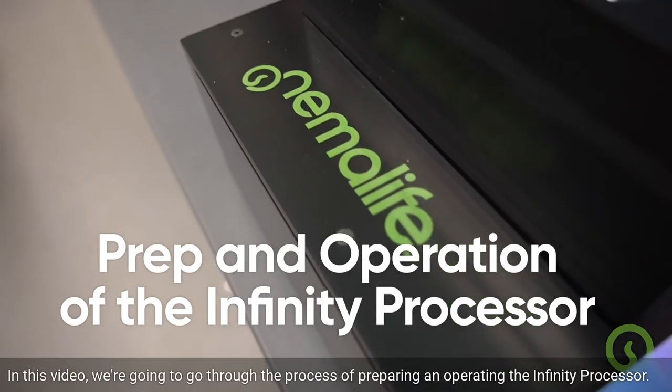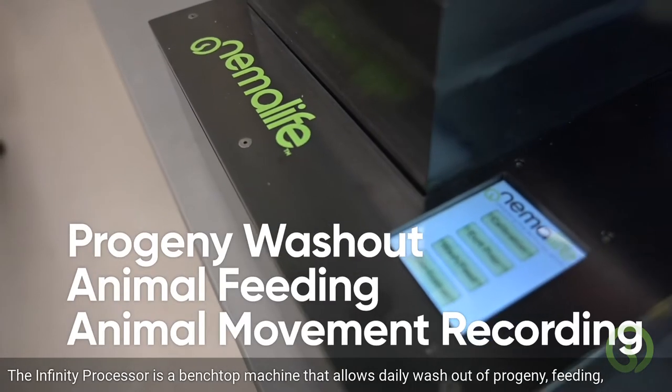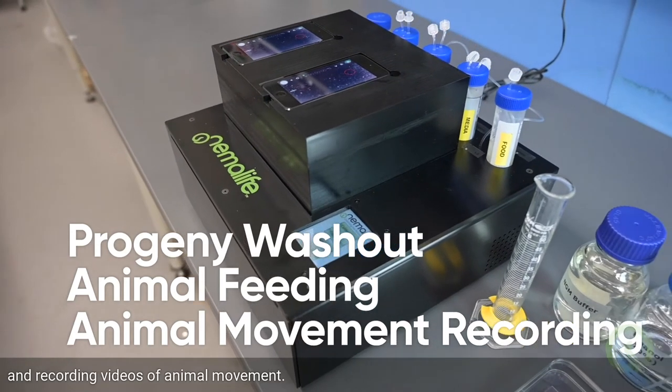In this video, we're going to go through the process of preparing and operating the Infinity Processor. The Infinity Processor is a benchtop machine that allows daily washout of progeny, feeding, and recording videos of animal movement.